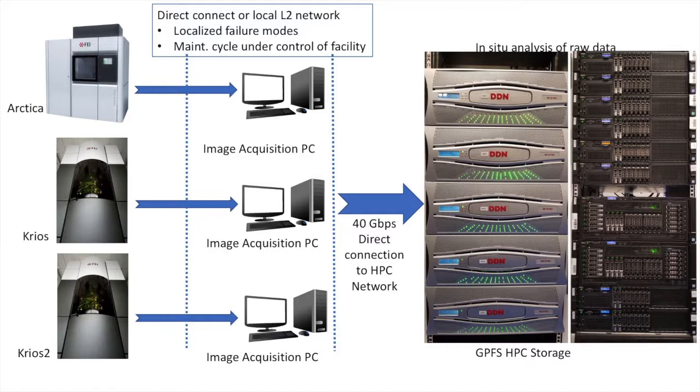One of the things we found here was, we were essentially doing that, and originally we were pushing data from these local workstations to the centralized archive in near real time with periodic rsyncs and whatnot, and originally found that actually just broke the campus network. That would happen, and email would stop working, and Anthony would yell at me, and so on.